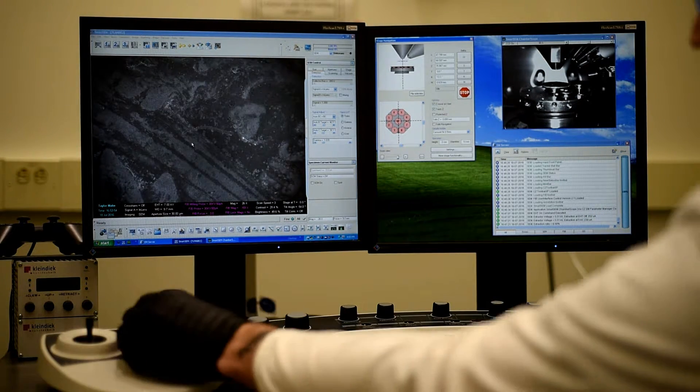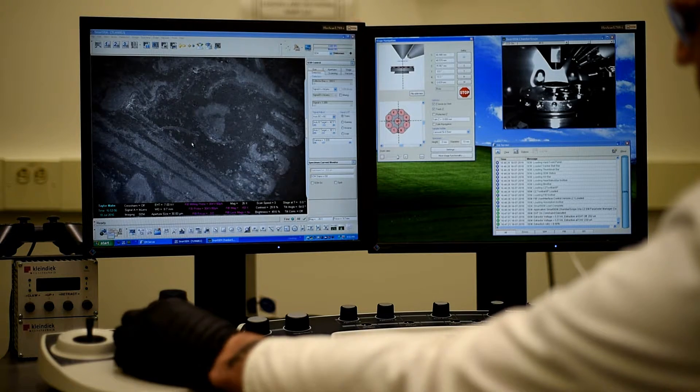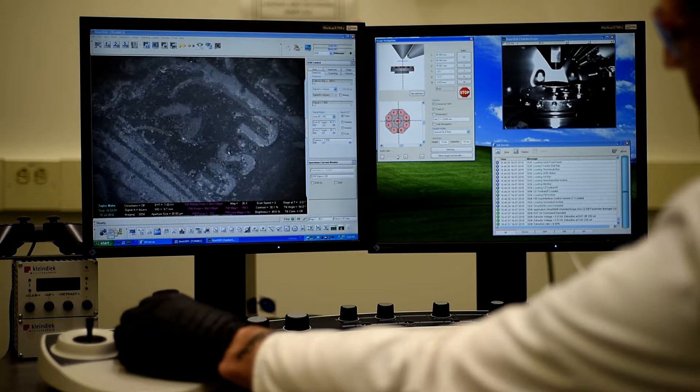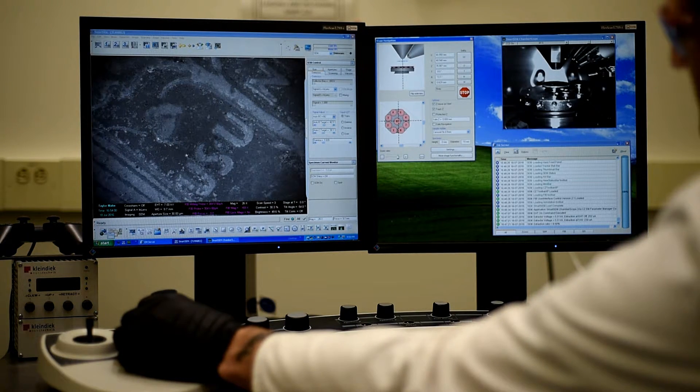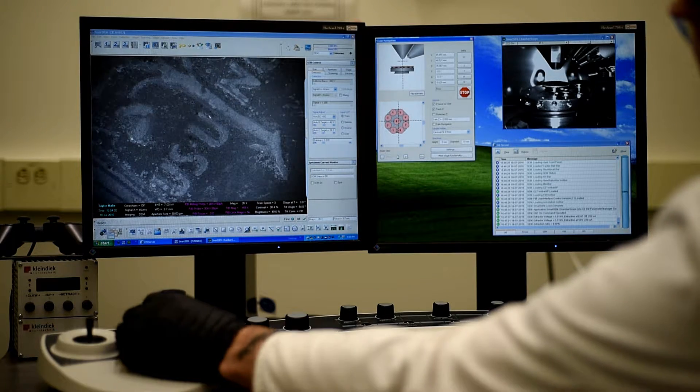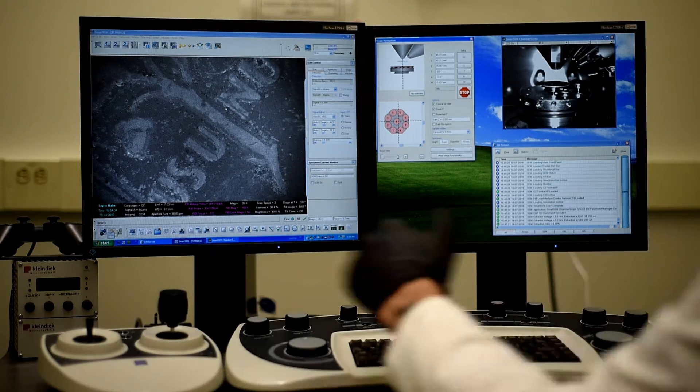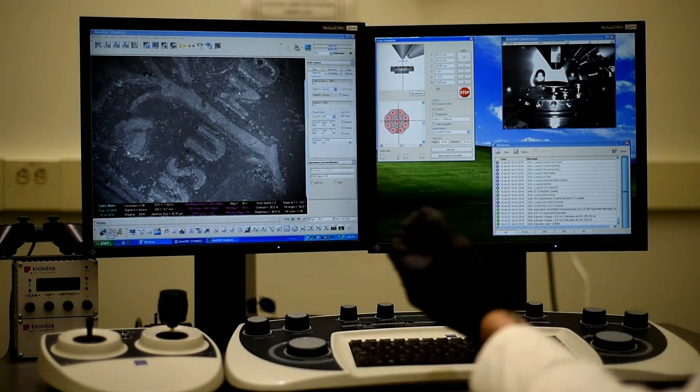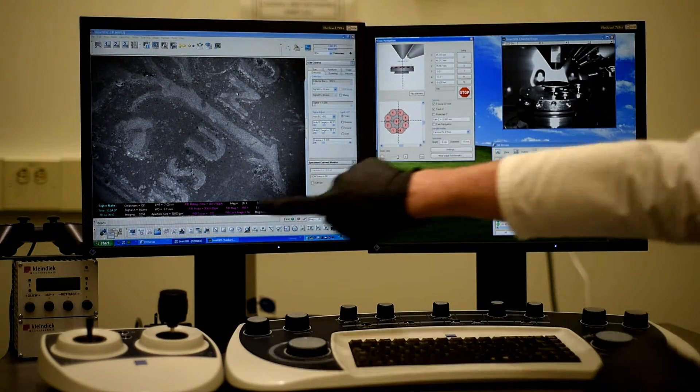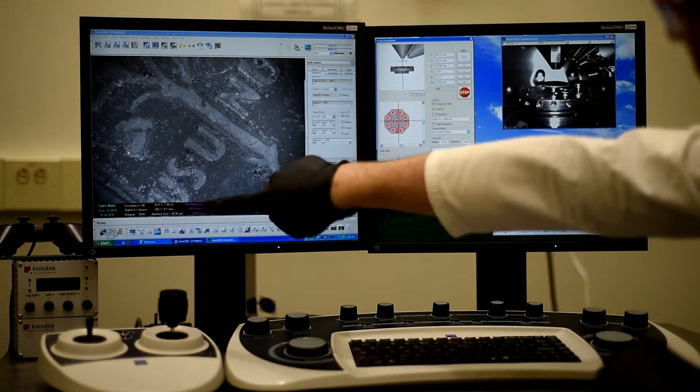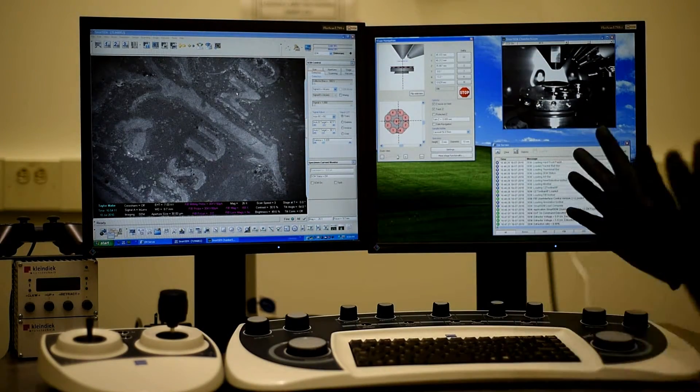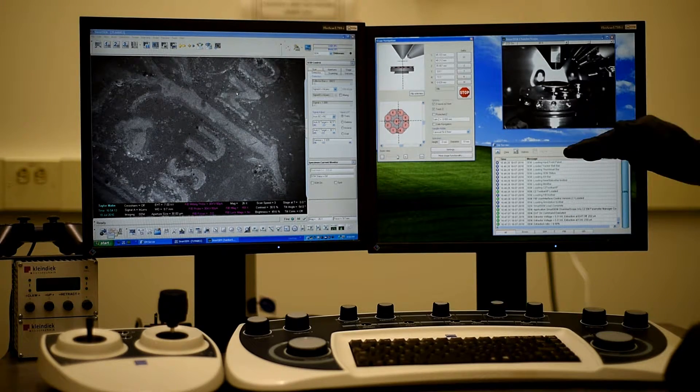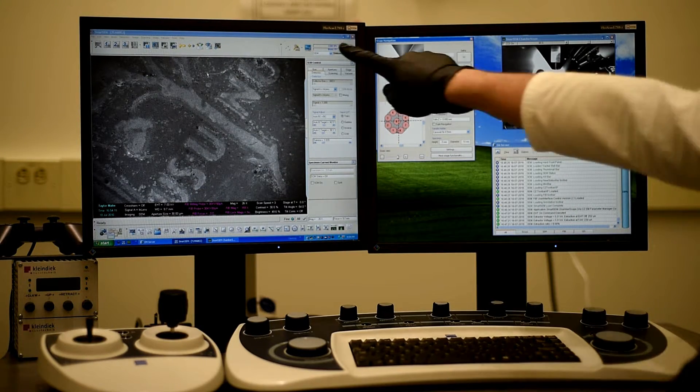So now we can move X and Y with this joystick here. And we can see here part of the Latin that's inscribed in the dime. Another way, if you wanted to get the orientation right, so you can see that the letters are written this way.